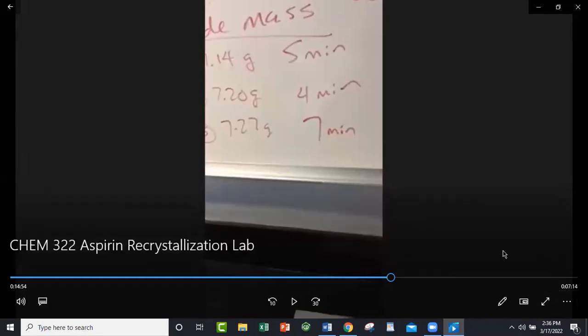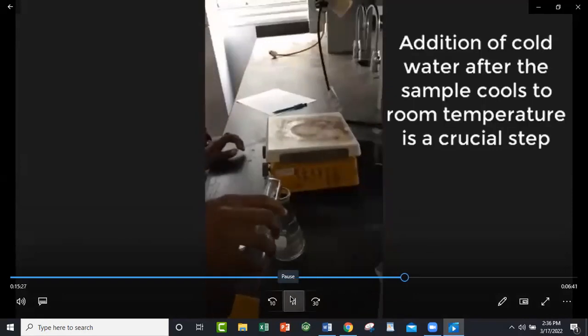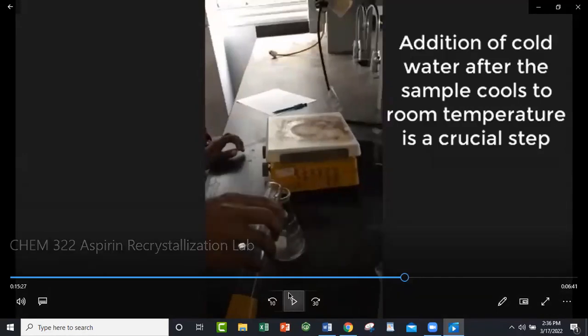Then the time it took was 5 minutes. Just add it. So now this is the next to last step, which is to add that cold water. So you let your sample cool to room temperature, and then you add cold water.